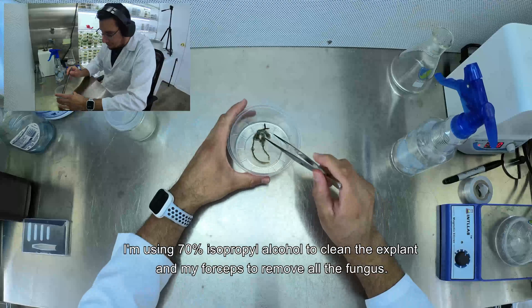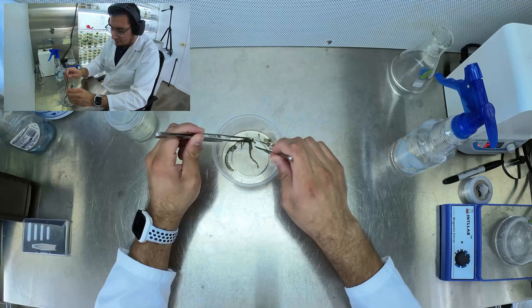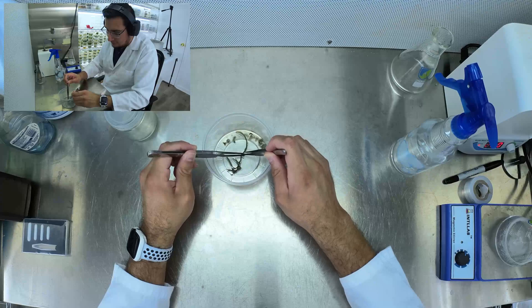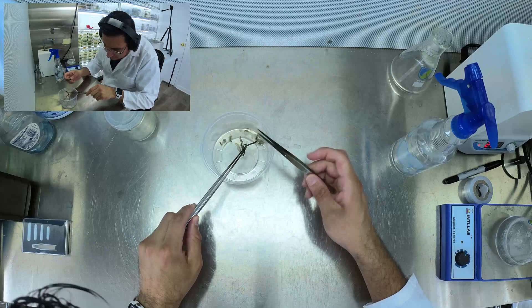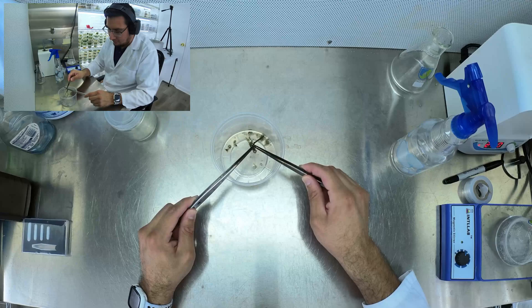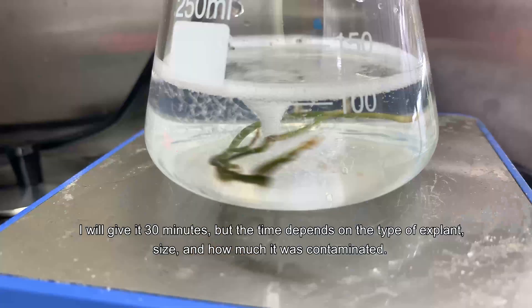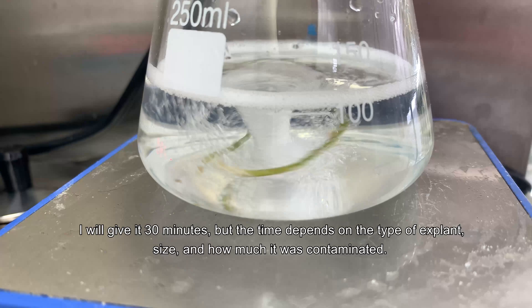I'm using 70% isopropyl alcohol to clean the explants and my forceps to remove all the fungus. Place the explant in the sterilizing solution and set a timer. I will give it 30 minutes, but it depends on the type of explant, its size, and how much it was contaminated.